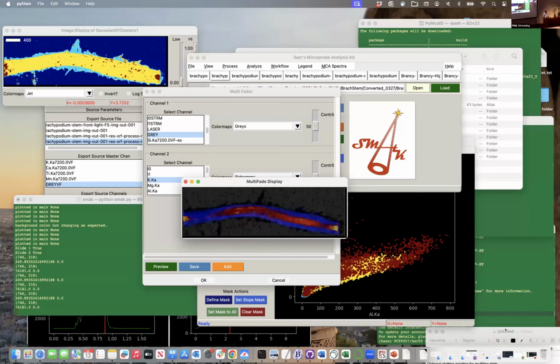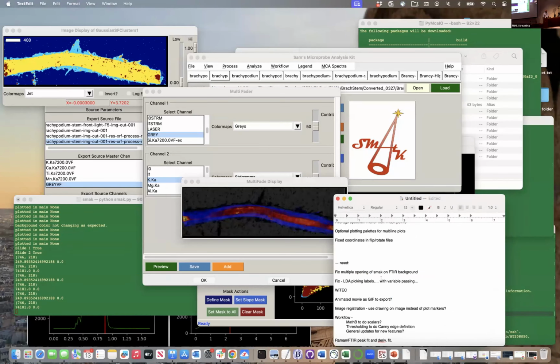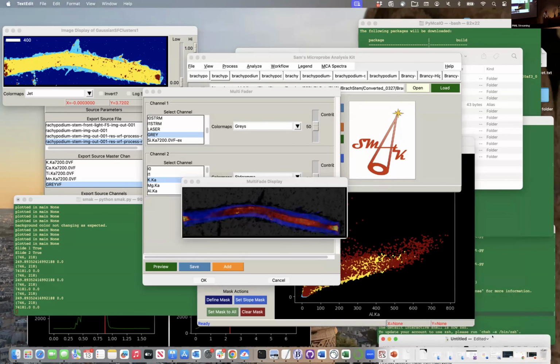See, I have this little notepad right here that I've been hiding with all the things I need, and we're going to go multi-layer TIFF. Yeah, I mean, I was thinking, especially from some of the XRF data, and just because there are other tool sets outside of this, elemental data mapping would be super useful to these online tools, if we had those overlays with mass spec imaging tools or something like that, where someone could pick what channel they wanted.